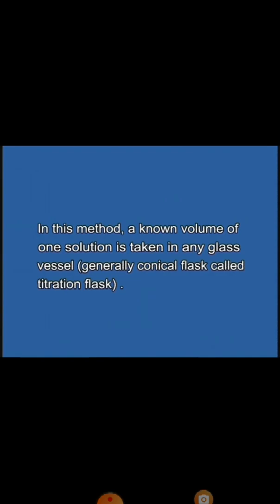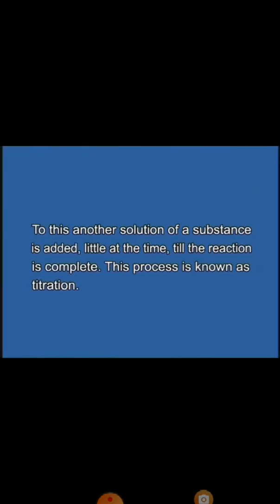In this method, a known volume of one solution is taken in a glass vessel, say a conical flask or titration flask. To this, another solution of a substance is added little at a time till the reaction is complete. This process is known as titration.